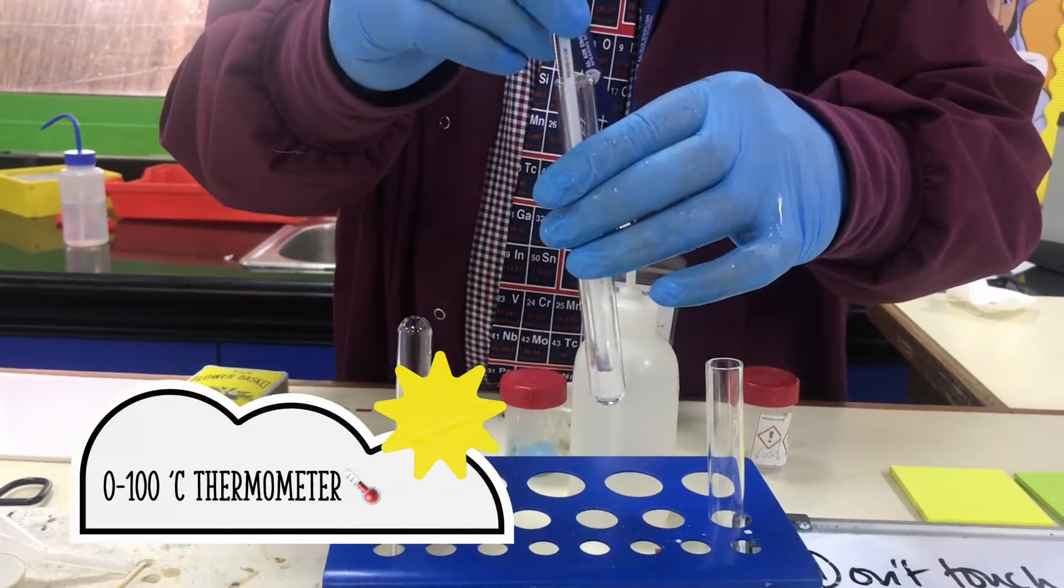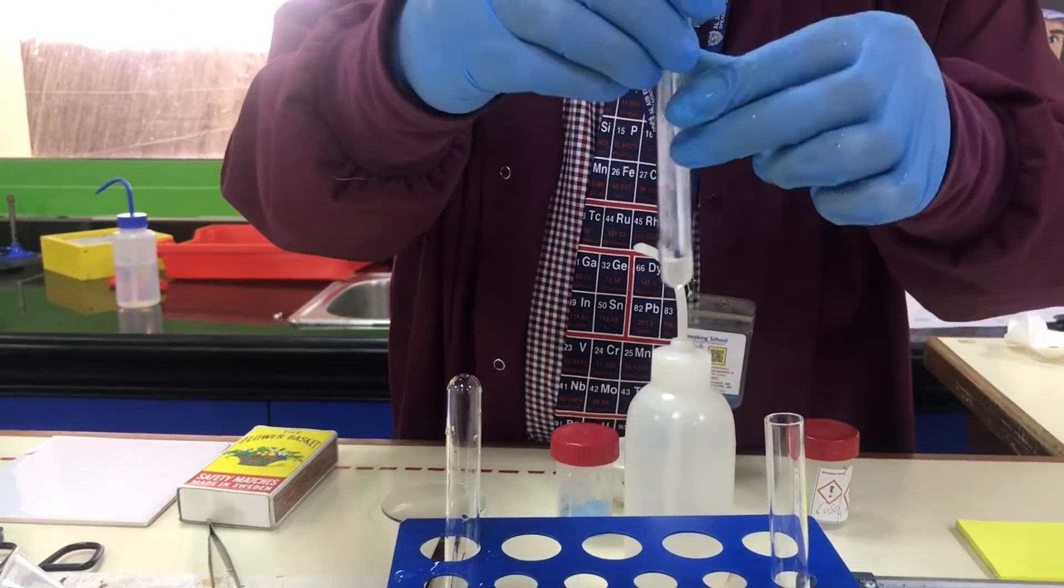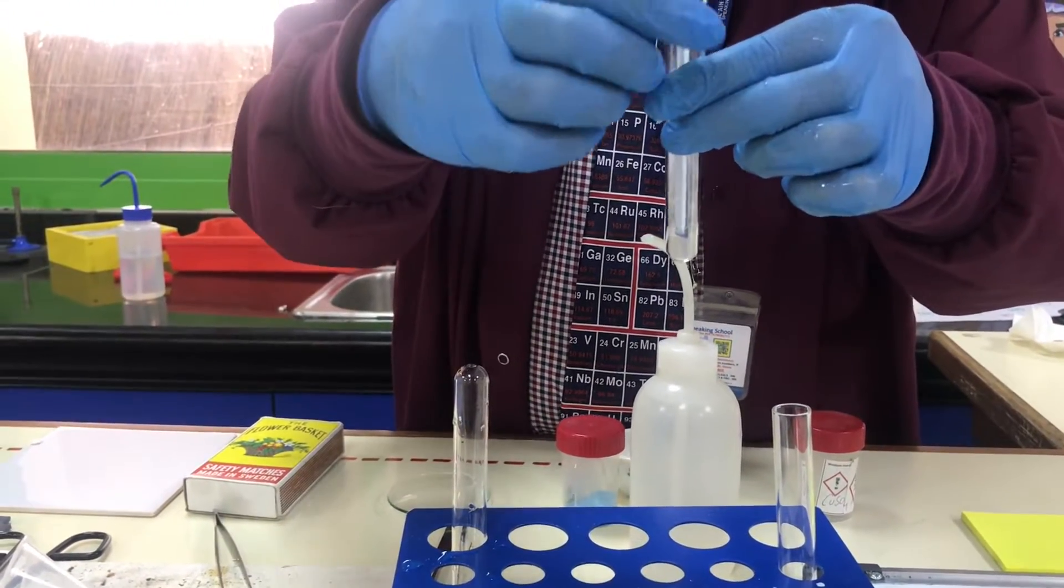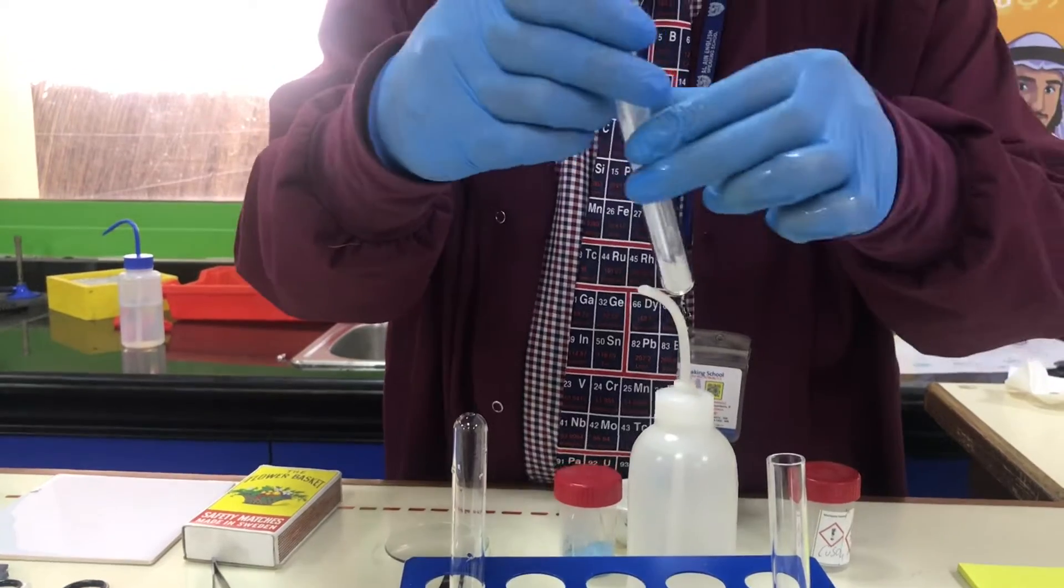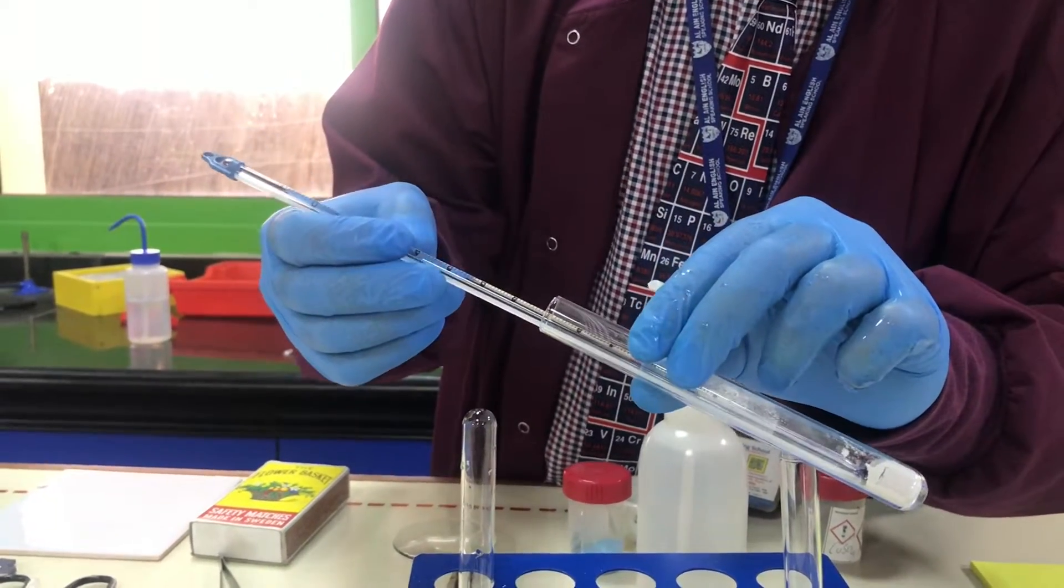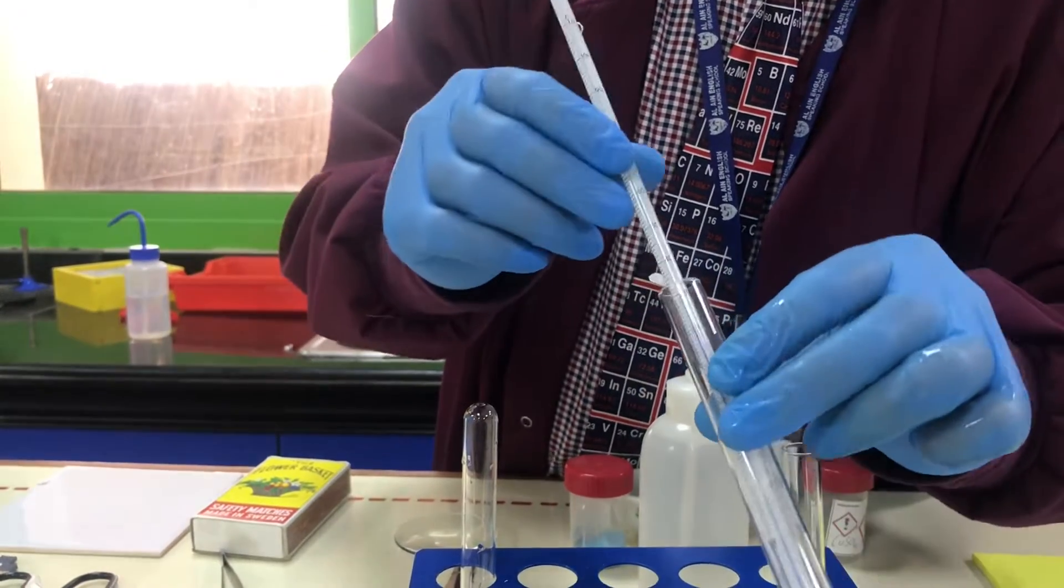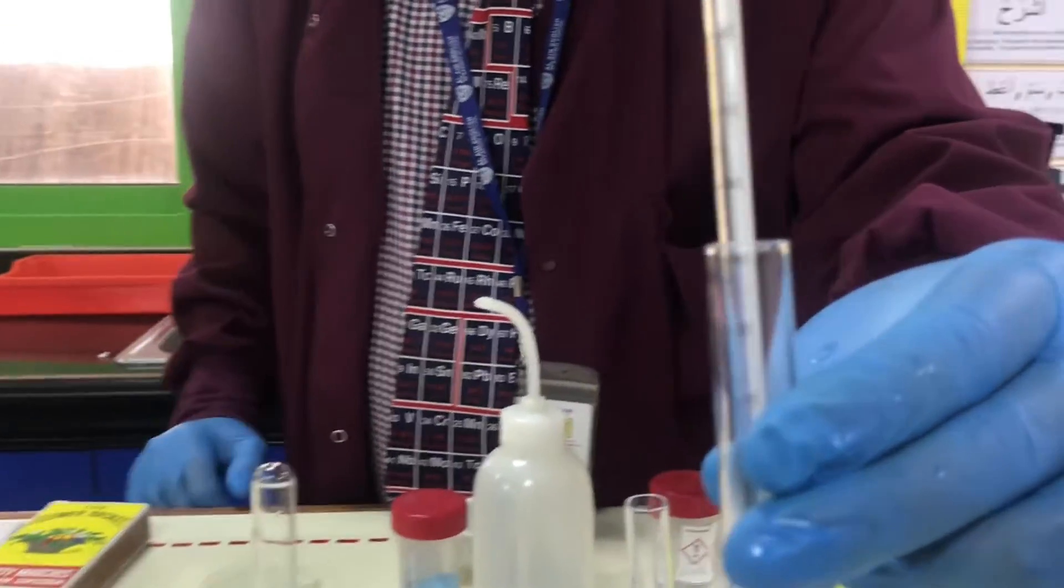Okay, so I've got my anhydrous copper 2 sulfate in a test tube here and what I'm going to now do is just add a thermometer in there and it's cooled down quite nicely. It's quite warm in the lab at the moment and it's just sitting quite nicely at 30 degrees centigrade.